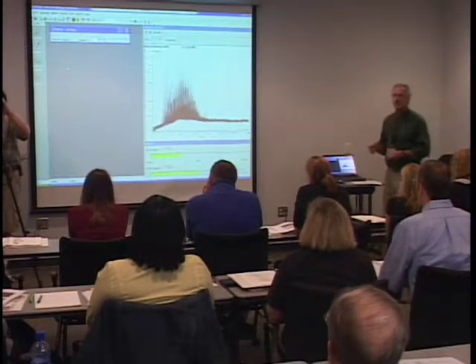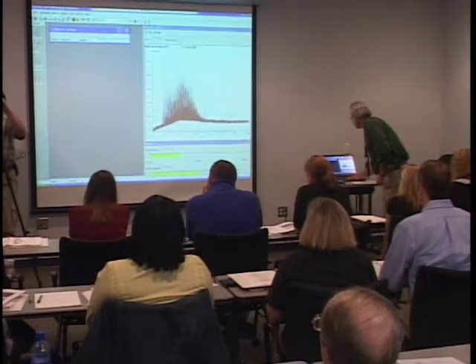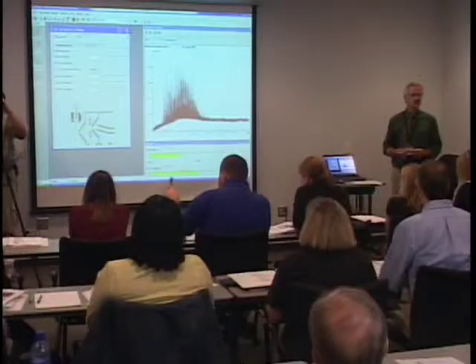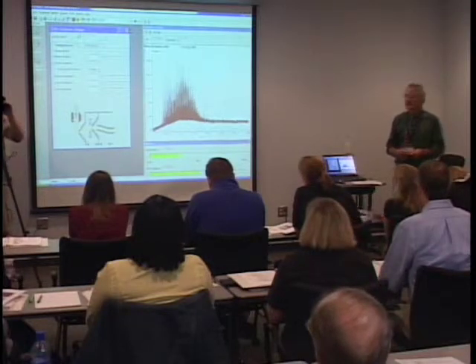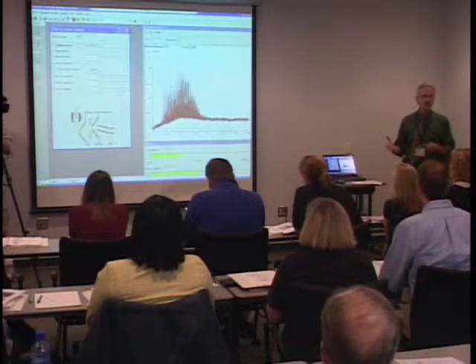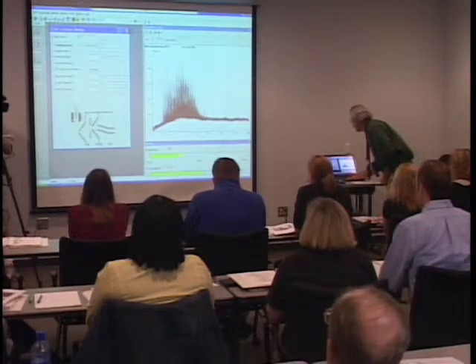Let me show you the two parameters that will be important in all of our discussions. If you go to the ion source, this is the orifice voltage. Raising that from 20 to 60 to 90 or whatever voltages Bob will be talking about will cause more fragmentation. I'm going to lower the RF ion guide voltage so you can see the water and air peaks. That's on the analyzer tab.